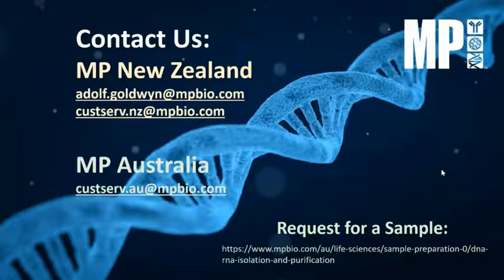And to minimize the loss of sample, in the case where your diluted sample is a fecal sample, we recommend you skip the pre-wash step and increase the homogenizing speed. By skipping the pre-wash step, you remove the possibility that the DNA can get washed away, or that you are removing precious DNA that is already present in low amount in your diluted samples. Increasing the homogenizing speed also gives more movement and force to break the cells, especially when you are already having low yield from your samples.